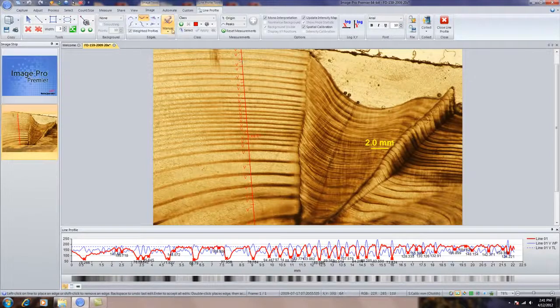I can also, if I need to, by holding down the Shift key, remove one. So I can easily edit my edges. So if you need to do manual review and there was an extra one, you just pull those out.